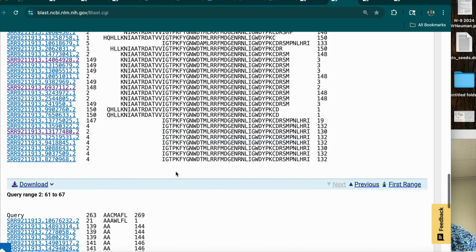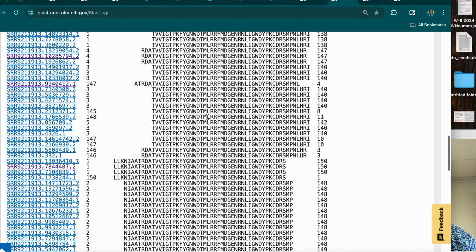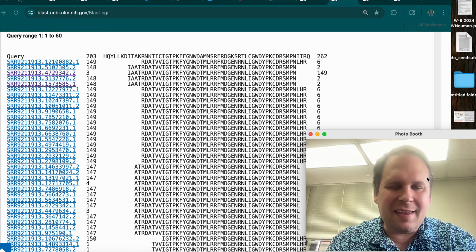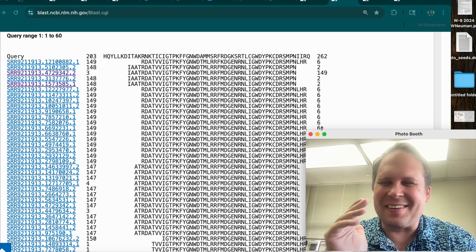And there we go. These are all of the potential amino acids. It's going to show you all the first ones, and then you scroll down, you can see the end of it. That's fine. Doesn't matter which one we pick. For this one, I picked this read. Rather, what matters is you need to pick a forward read. Otherwise, your life will be difficult from the start. Don't make it difficult from the start. It gets difficult later.